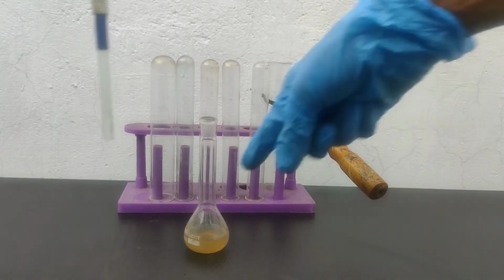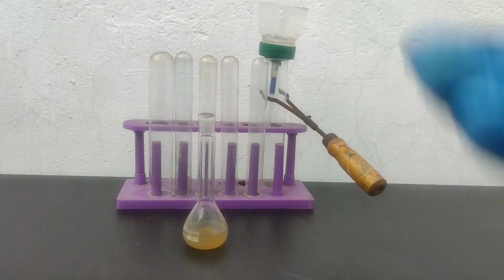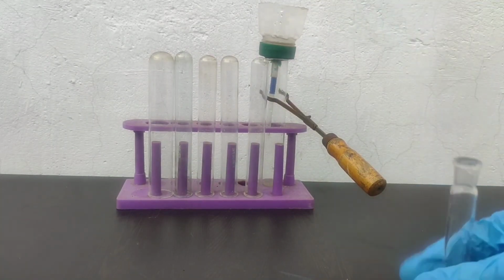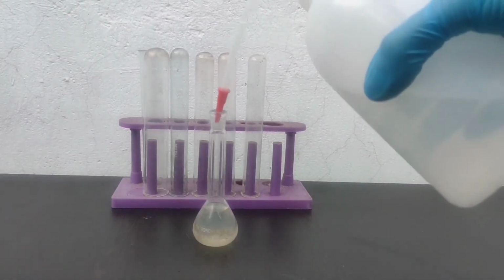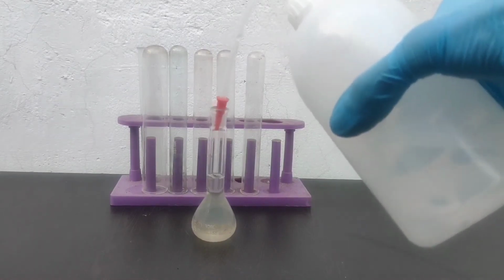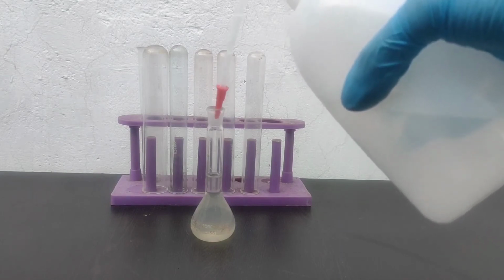So I decided to filter off this solution with this Hirsch funnel. I have made this Hirsch funnel. So now I am pouring all my silver nitrate solution into this. After filtering, the funnel was washed with distilled water and the volume was then adjusted to 25 ml in the 25 ml volumetric flask. So what I got here is a 0.25 normal silver nitrate solution.